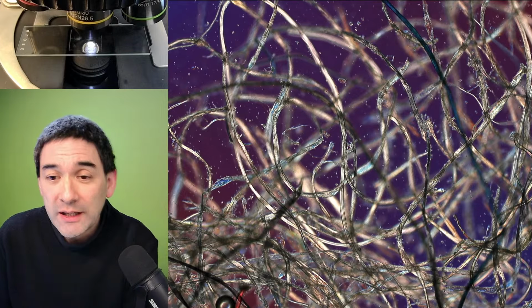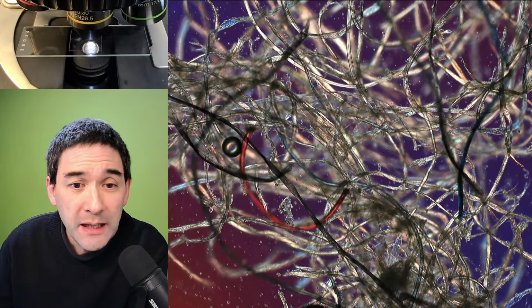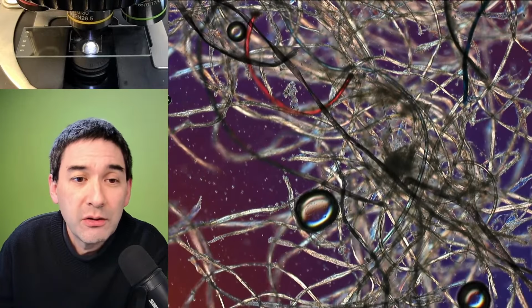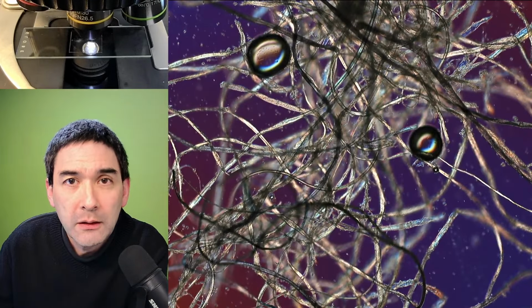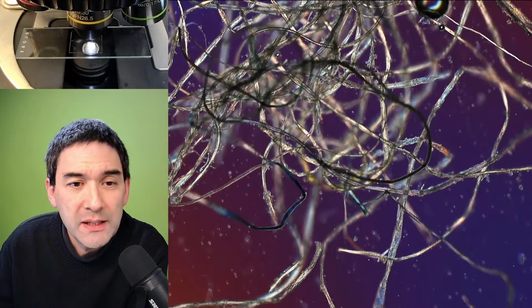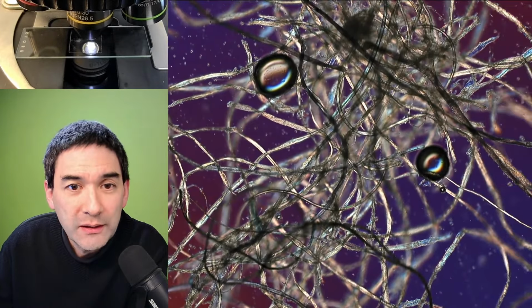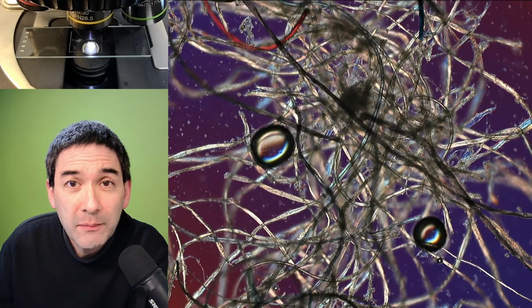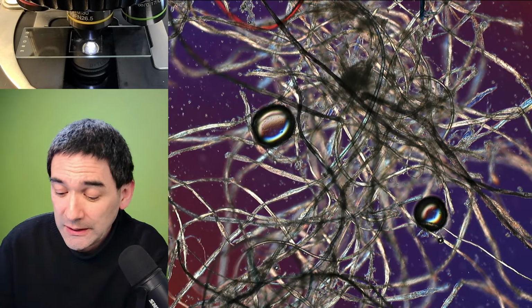Okay, very nice. So what you see over here is already a live image. You can see that there are some bubbles in here, and these are fibers from my clothing. Where did I collect them from? Last week I already told you that I collected a few of them. They collect inside the belly button over a couple of hours.